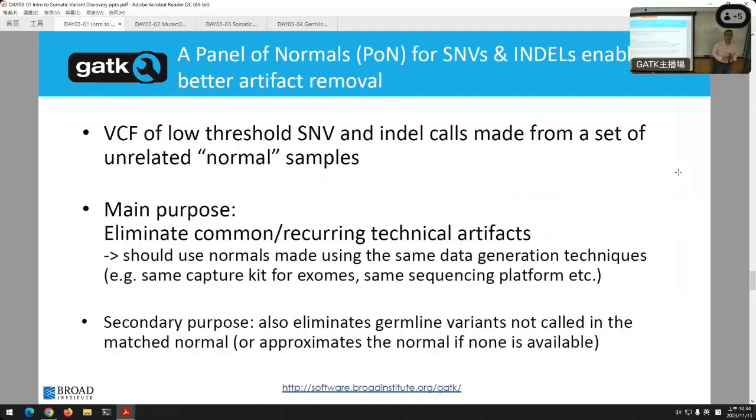We know that there are positions in the genome that are systematically bad. We can see them when we do our filtering. We have a call set of 100 samples, and we filter some sites out because we can see them bad in all our samples. We told you that. Well, guess what? When you sequence a tumor, they'll also be bad in the tumor too. They're going to show up there. And because they are not great, they'll look like somatic mutations, because we said the somatic mutations look bad. So the artifacts from the sequencing will also look like somatic mutations.